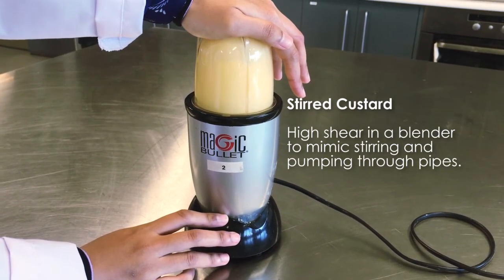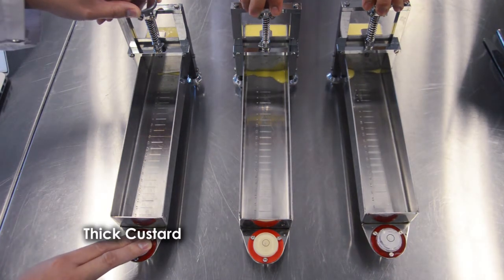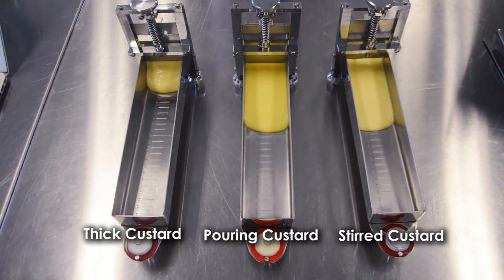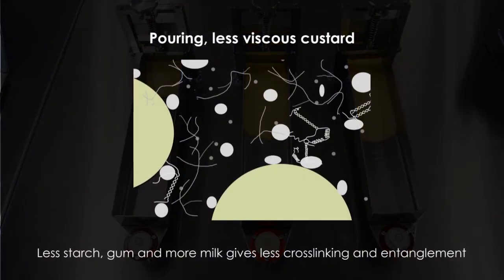We will perform an experiment with a Bostwick consistometer for three samples: thick custard, pouring custard, and the stirred thick custard. As can be observed, the thick custard flows very slowly while the pouring custard flows faster. The pouring custard, which comprises less starch and gums, has less binding and friction in its microstructure, hence it is a weaker gel than the thick one.